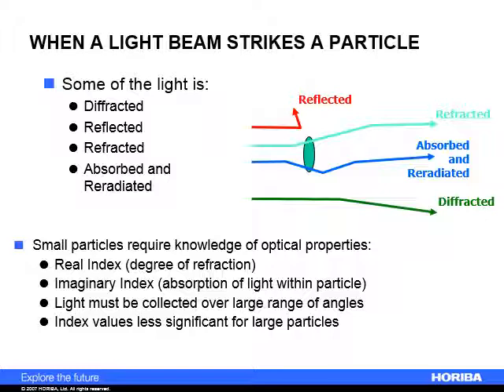By knowing how light interacts with a particle, we can determine the size of what the particle is. By having knowledge of some of the optical properties of the material, the refractive index, both the real and imaginary, and understanding how a machine is set up to act with the diffraction of light, we can determine the size of particles.